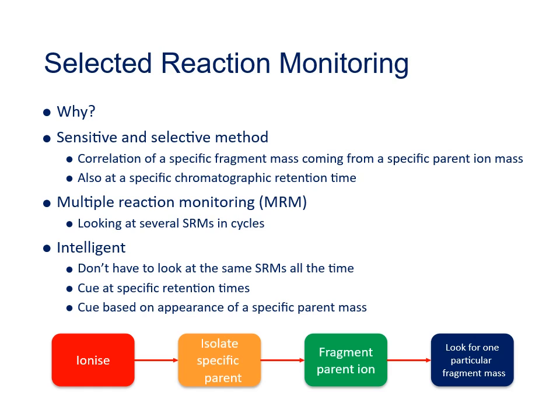Of course, for most of a chromatographic run, your molecules of interest are not eluting from the chromatograph. So it's not sensible to have your mass spectrometer try to look for a molecule you know shouldn't be there at that time. So often these are turned on intelligently. For example, a selected reaction monitoring method may be turned on in the tandem mass spectrometry part of your system at the correct retention time for that product to elute. Or alternatively, your system can look to see if a particular mass corresponding to the parent mass appears, and if it does, then turn on the MS for that ion.